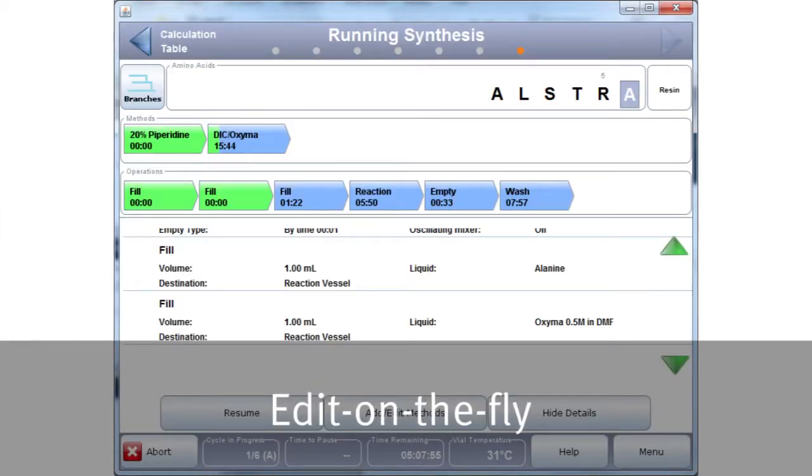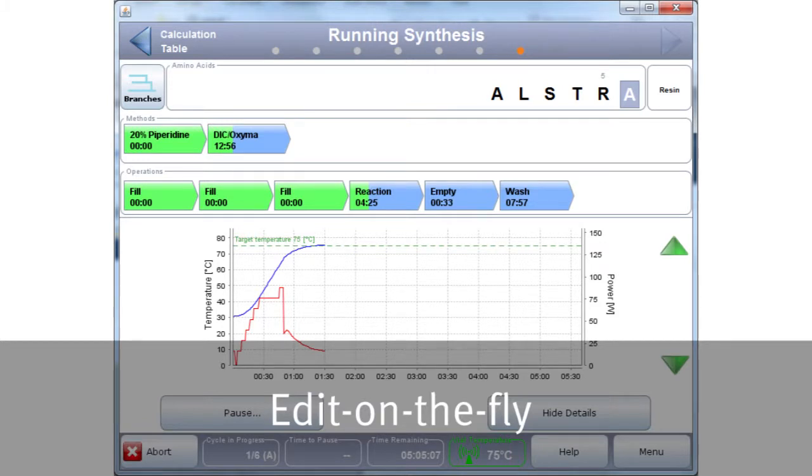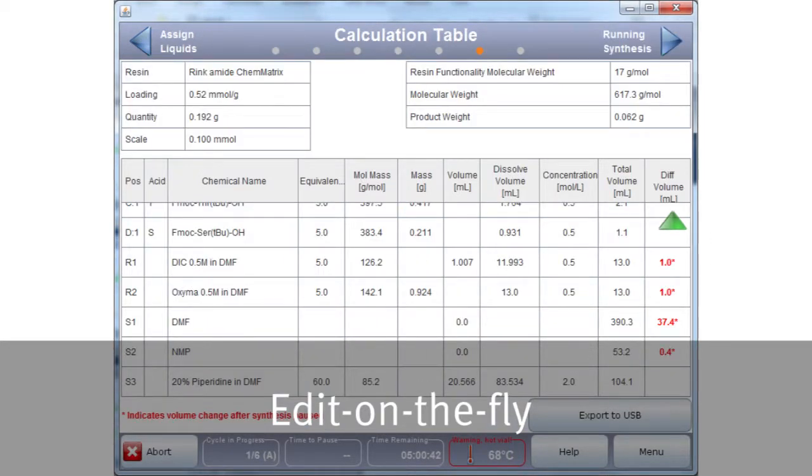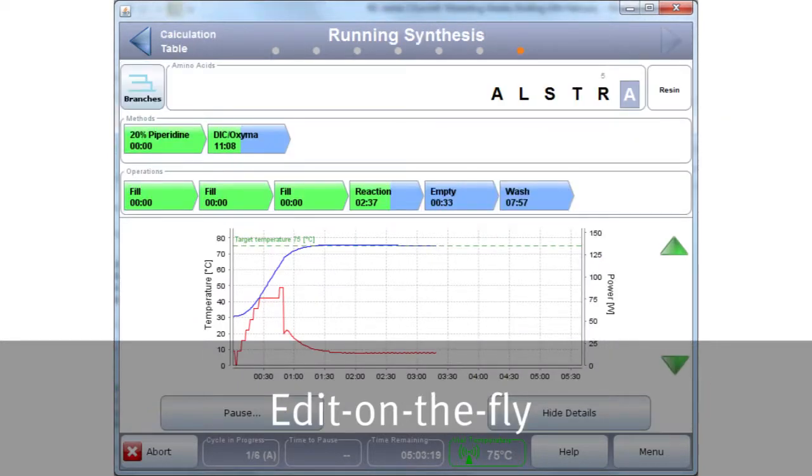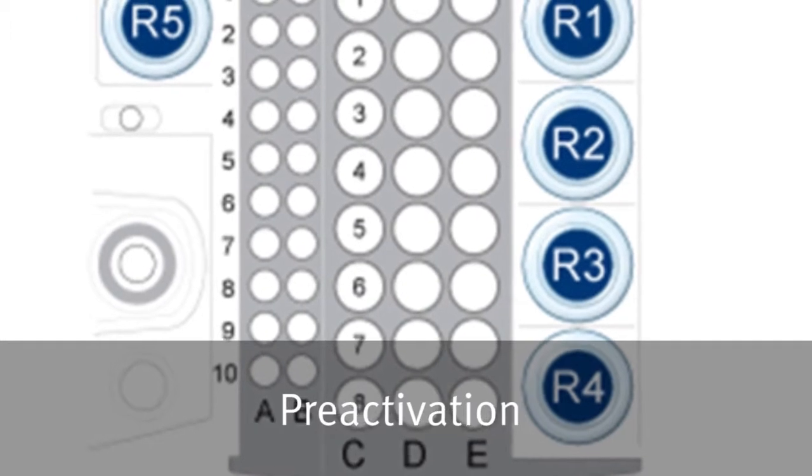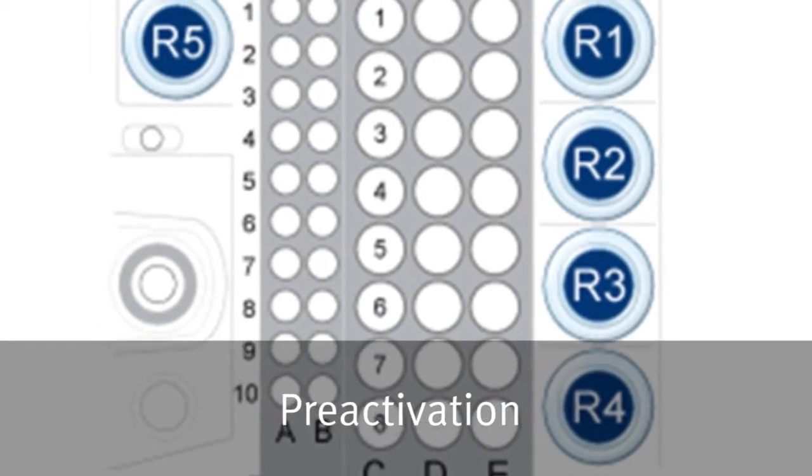The fully automated and semi-automated capability provides complete control over all reaction steps, allowing changes to be made quickly. Choose to activate the amino acid in situ or pre-activate any amino acid in a cycle.